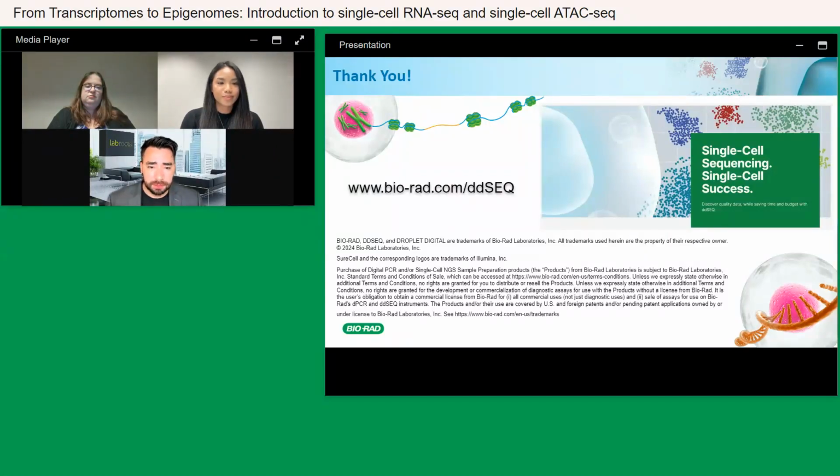Great, thank you so much for that, Errile. It looks like someone wants some clarification here about the droplet size being smaller than 50 cell size. I'm not sure if you can see that question, Errile. I do. Maybe you can clarify. Sorry, I didn't enunciate, but it's 19. Perfect, thank you.